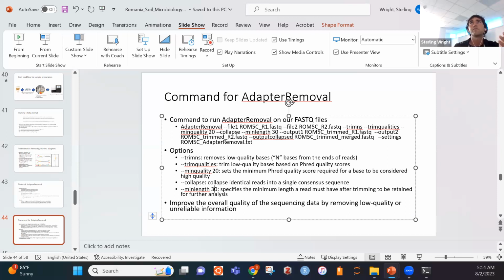As you lower the minimum length, you're accepting smaller DNA fragments, so you'll retain more of your data. But when you set it to a smaller length, you're more prone to mismatches, because short DNA sequences can be mapped to more different references. As you increase the length of DNA sequences, when you're mapping, you're more confident that the sequence belongs to whatever reference you're including. But doing that, you're going to lose some of your data.